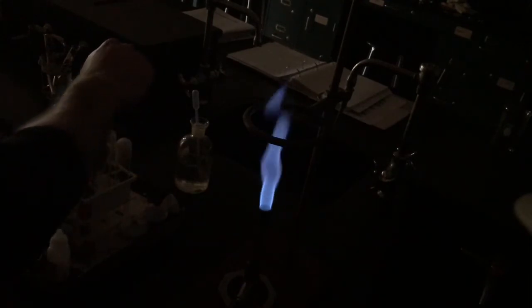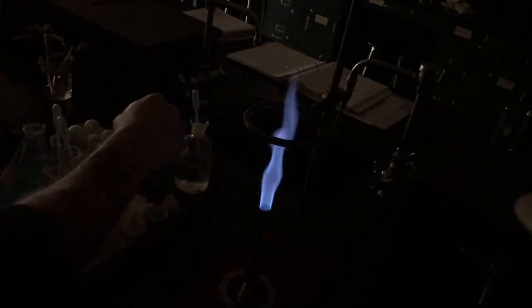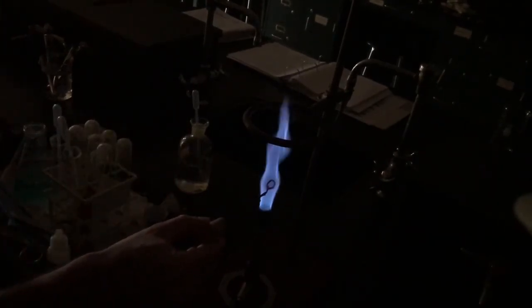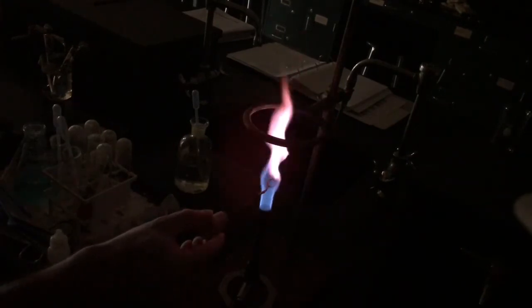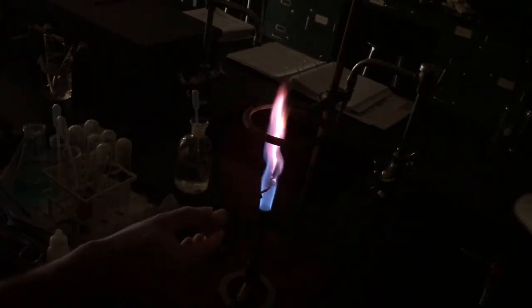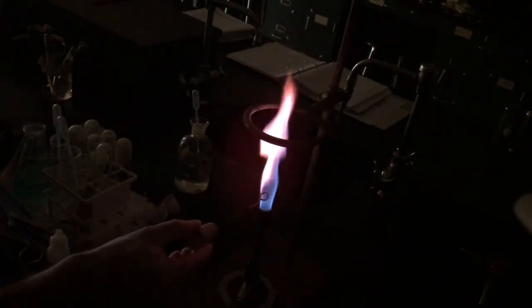Okay, so let's look at, I mean, this is potassium, sorry, potassium. So potassium has a lavender flame. You can tell right there, it's going to be lavender.